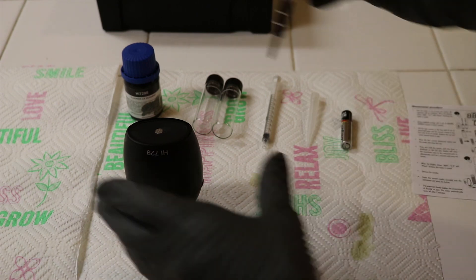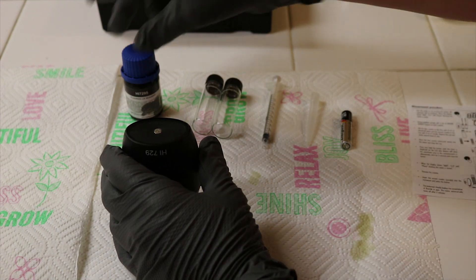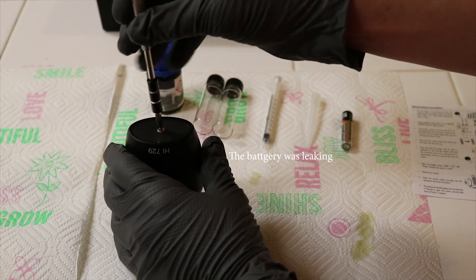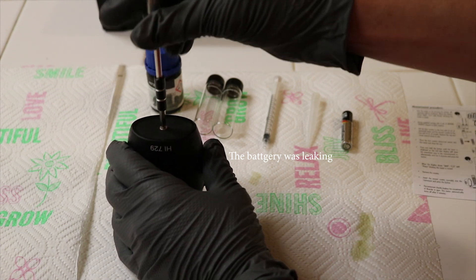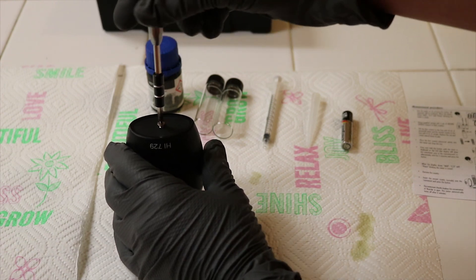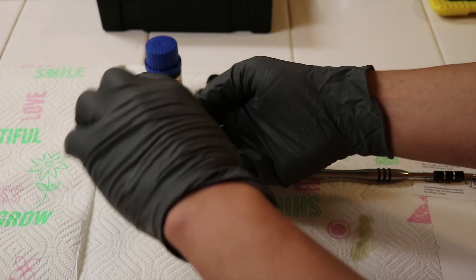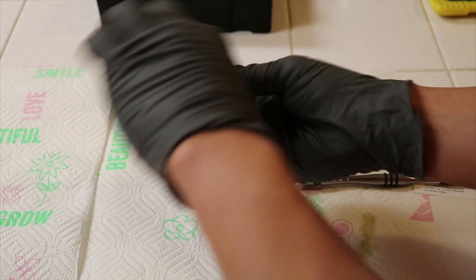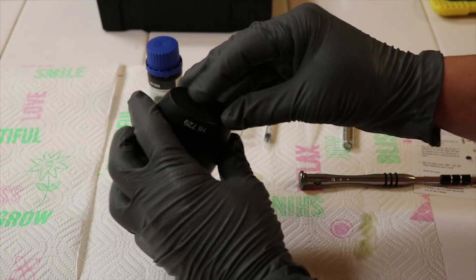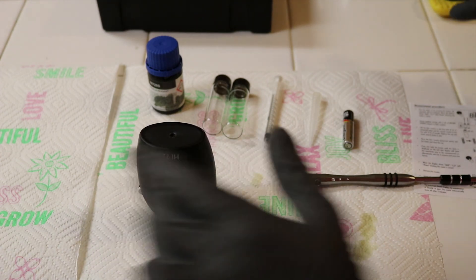First things first, it says to install the battery. Now there was a little bit of something leaking — I don't know if it was coming from this or from the battery. Some got on my hands, I just washed it off, didn't feel any irritation or anything. But I put some gloves on just to be safe. Let's go ahead and undo this screw and install the battery. Let me find something that's going to get that out of there.